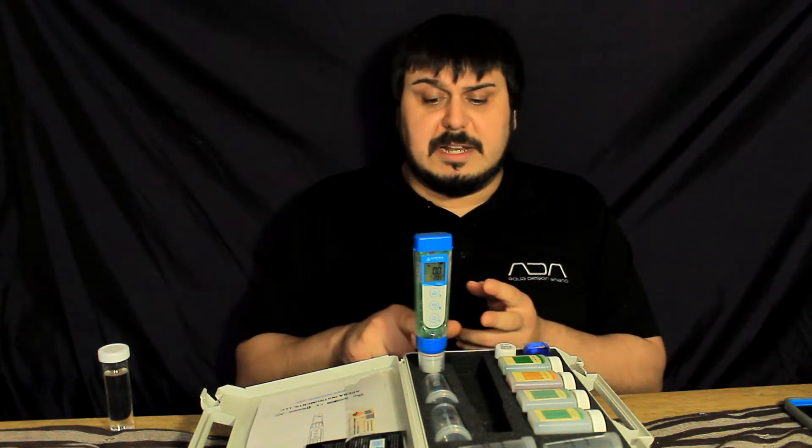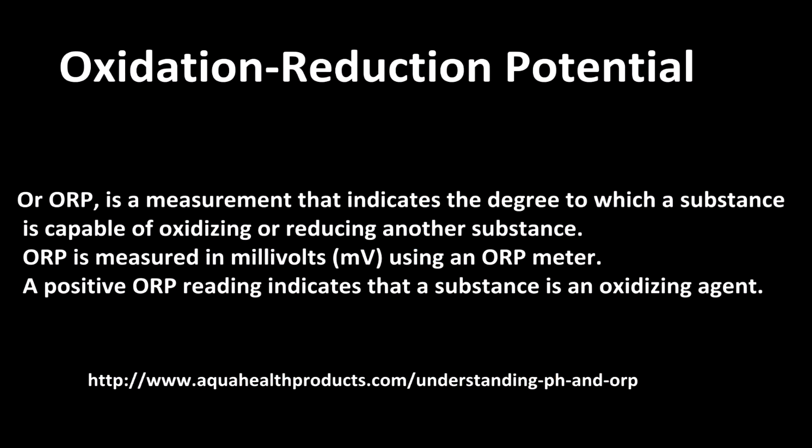It also covers ORP, but you need a special probe for that to work. So what I want to do now is get this box opened up, show you what the device looks like, and we'll go from there.